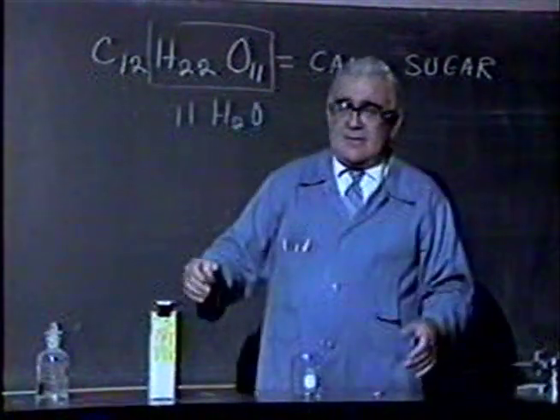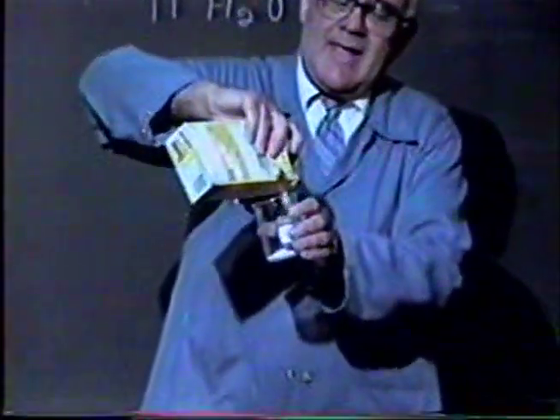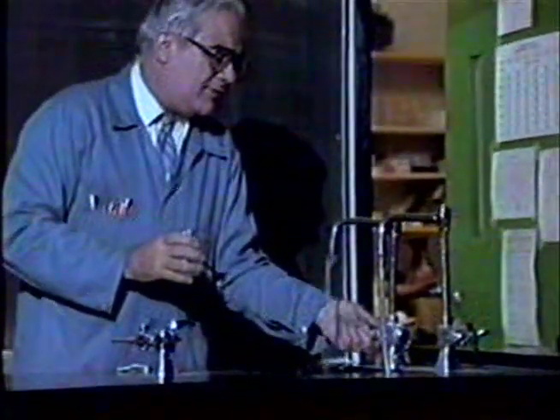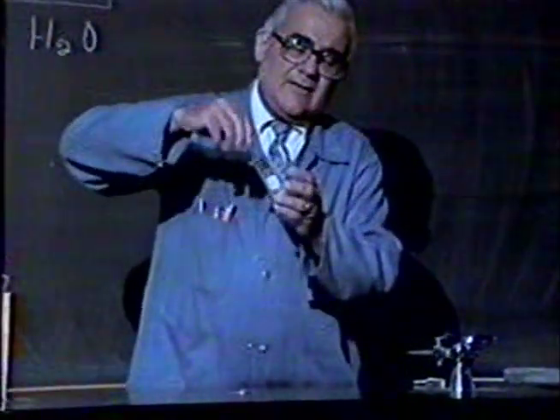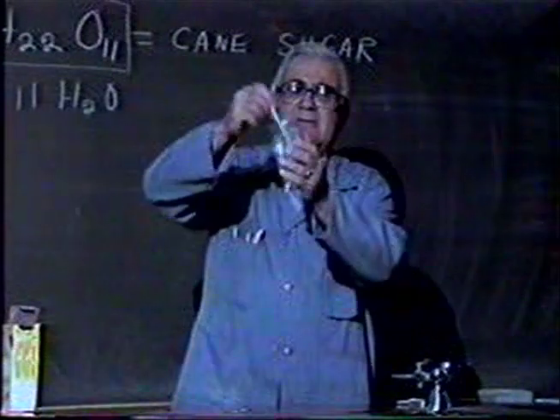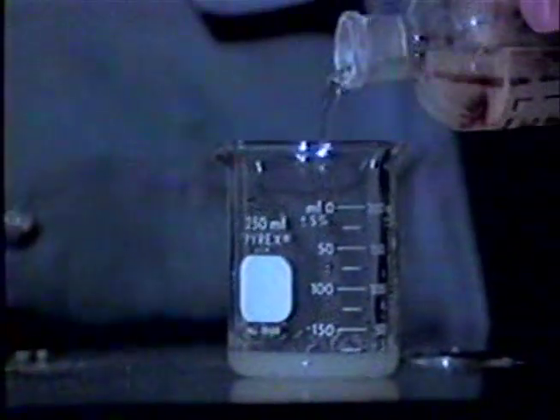You don't really need an awful lot of sugar, so it's not a very expensive project. I'm just going to put a little bit of sugar in the beaker. It works better if you just slightly wet the sugar — almost make a paste of it. Maybe a couple of drops of water, just enough to make a paste. That seems to get it going real well. I've made a little paste, and I'm going to take a little bit of concentrated sulfuric acid — it's the only one that works — and put it in the beaker, maybe just enough to cover the sugar. Let's watch what happens.